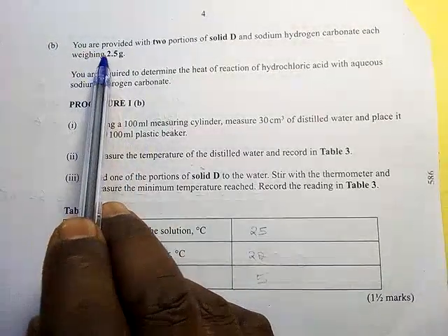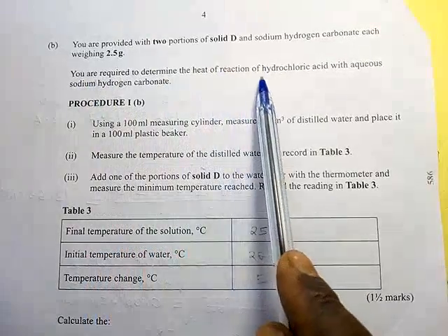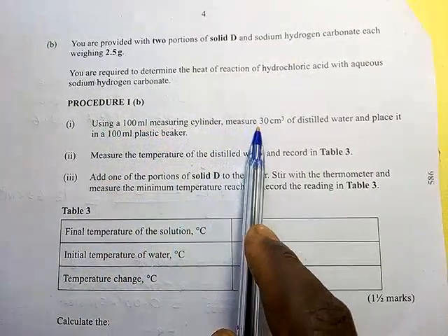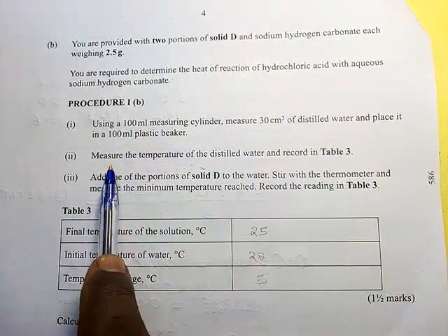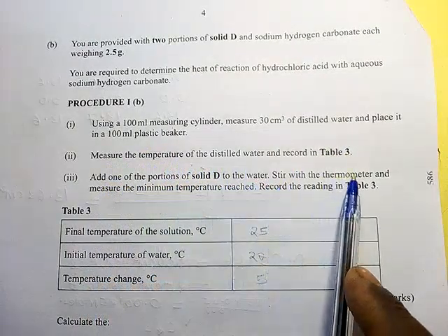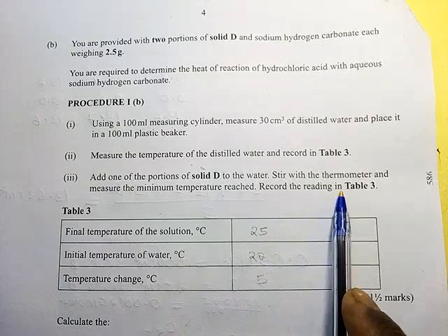Part B, you are provided with 2 portions of solid D, sodium hydrogen carbonate, each weighing 2.5 grams. You are required to determine the heat of reaction of hydrochloric acid with aqueous sodium hydrogen carbonate. Procedure 1B. Using a 100 ml measuring cylinder, measure 30 centimeters cube of distilled water and place it in a 100 ml plastic beaker. Measure the temperature of the distilled water and record it in Table 3. Add one of the portions of solid D to the water. Stir with the thermometer. Measure the minimum temperature reached. Record the reading.